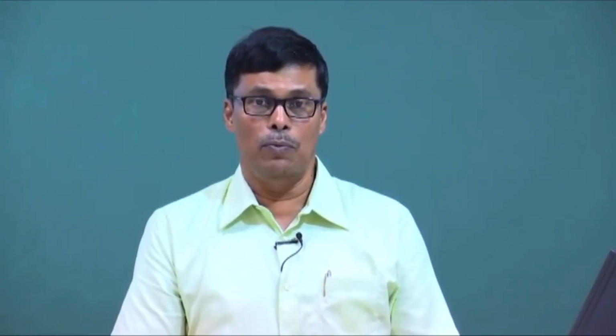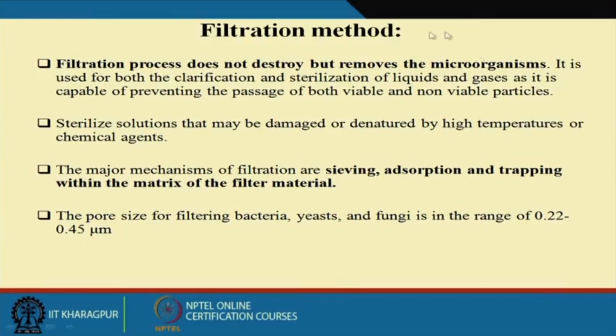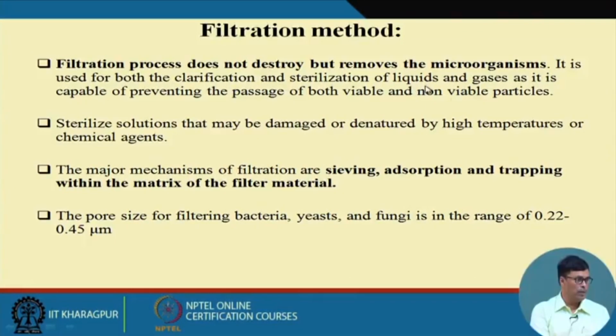But in case of low value products, we cannot, because for low value and high volume products, we cannot think of this process; it will be no good. So it is used both for the clarification and sterilization of liquids and gases, as it is capable of preventing the passage of both viable and non-viable particles. It sterilizes solutions that may be damaged or denatured by high temperatures and chemical agents. The major mechanisms of filtration are sieving, adsorption, and trapping within the matrix of the filter material.